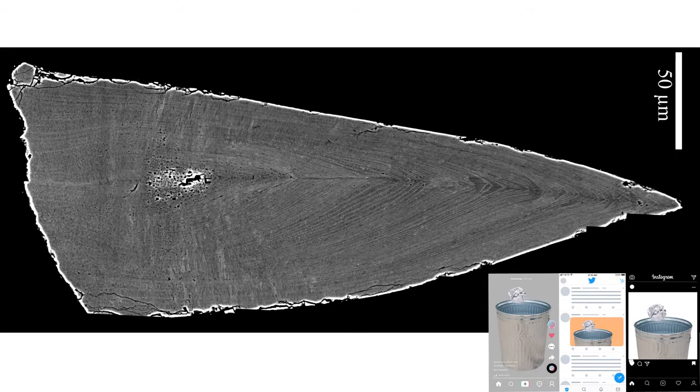When you do actually get a shot into the trash can, you're going to end up with something like this. It's not perfect, but this is a conodont that we have created a section through and you can very clearly see all the individual growth stages of it.